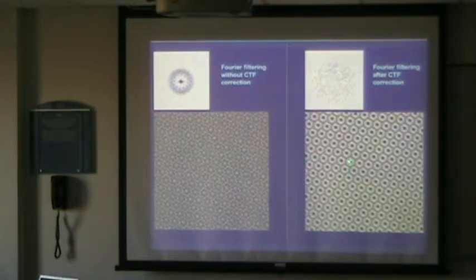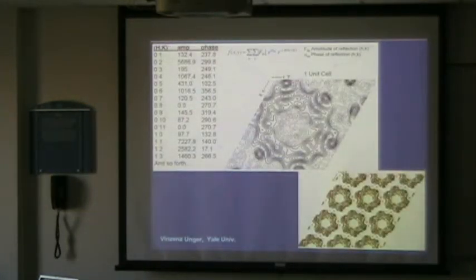In this case, you can see quite a bit of detail. Here this is essentially uninterpretable, but here we see some helices. This is actually a connexon from a gap junction. It's sort of a hexamer, and you see these helices. These little dots are helices. They are coincidentally exactly perpendicular to the axis, so that's a lucky case. If the helix were tilted, you wouldn't see it that clearly; you would see a smear. But that's the 2D reconstruction so far.